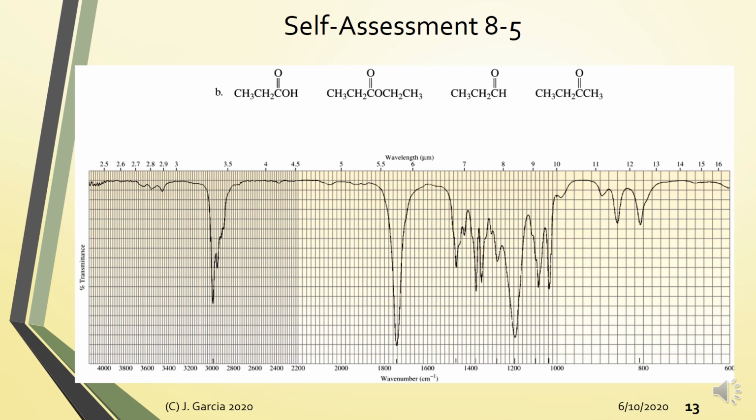Okay, so try this one also. So again, pause the video, okay, and try to answer, try to find the most suitable compound, no, for this IR spectra.